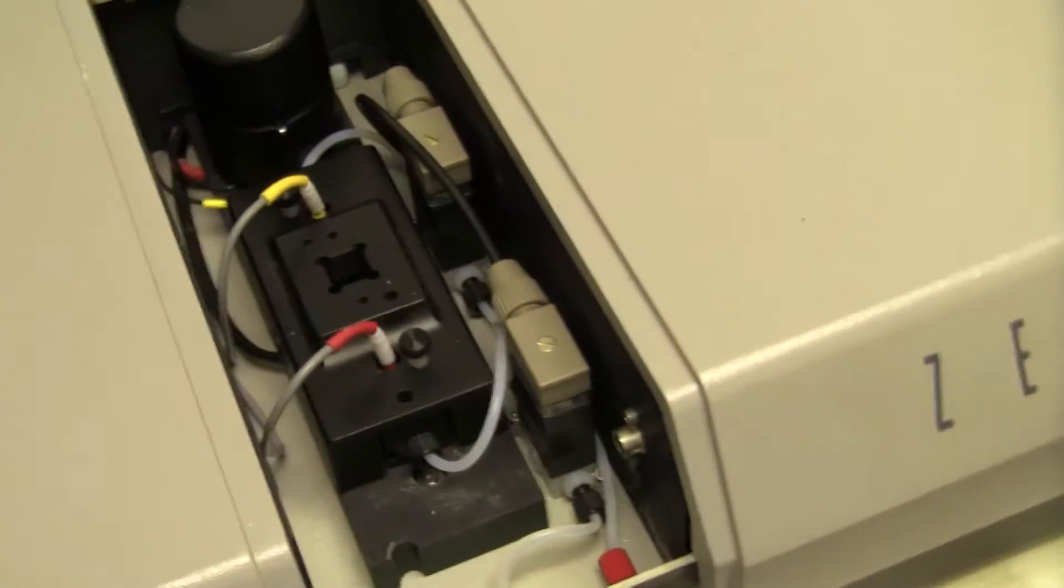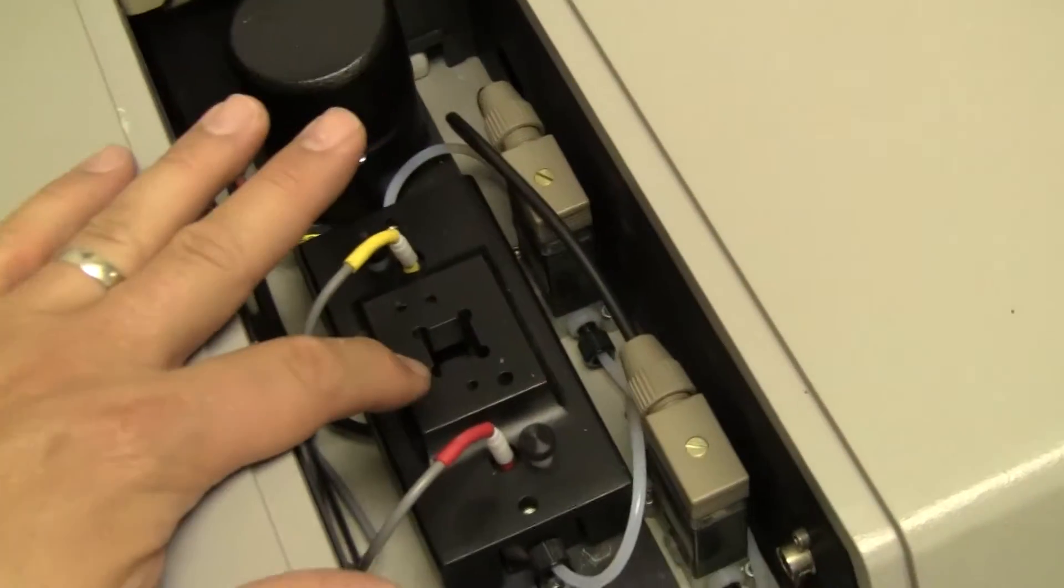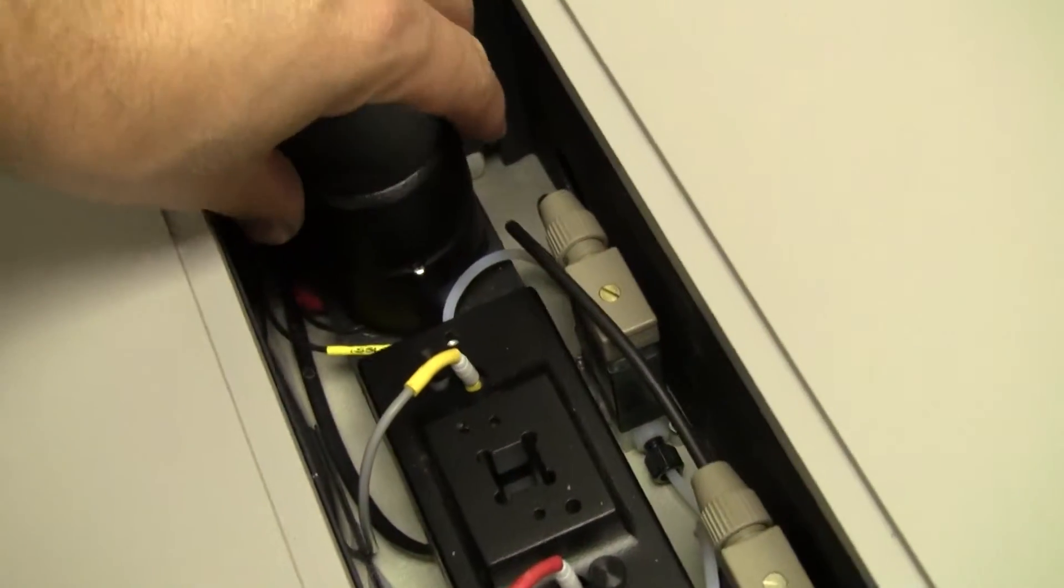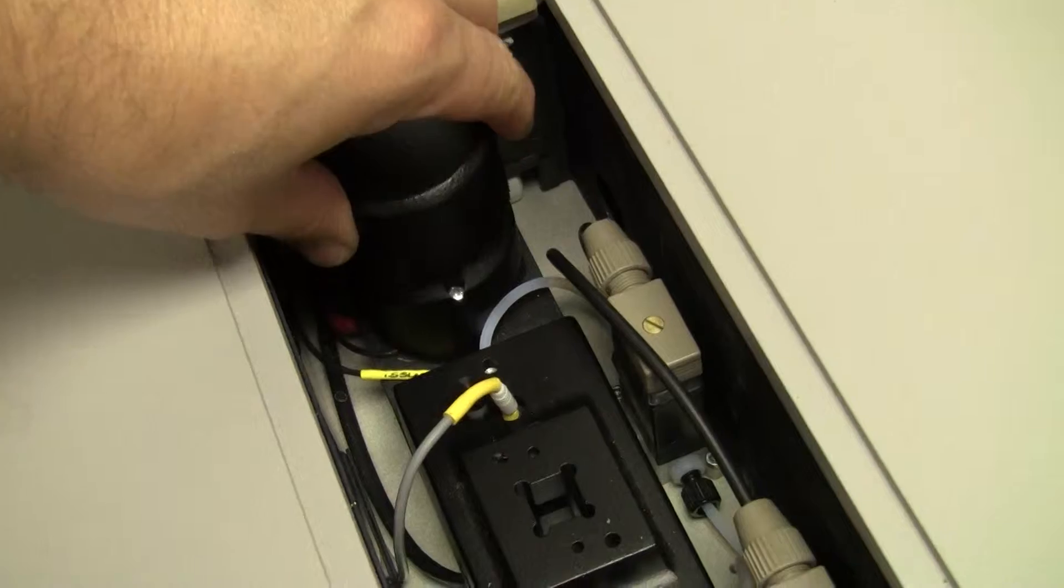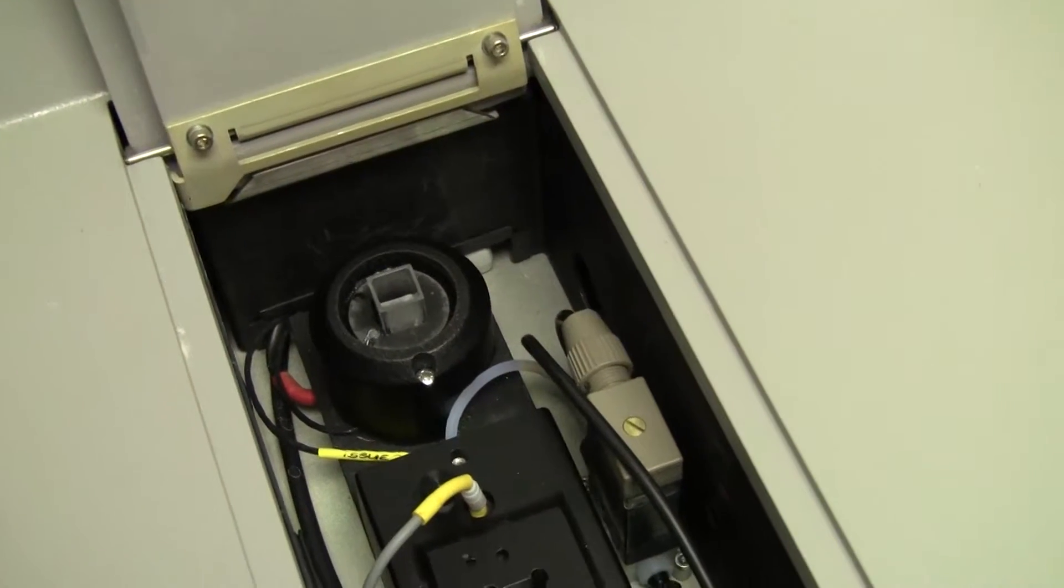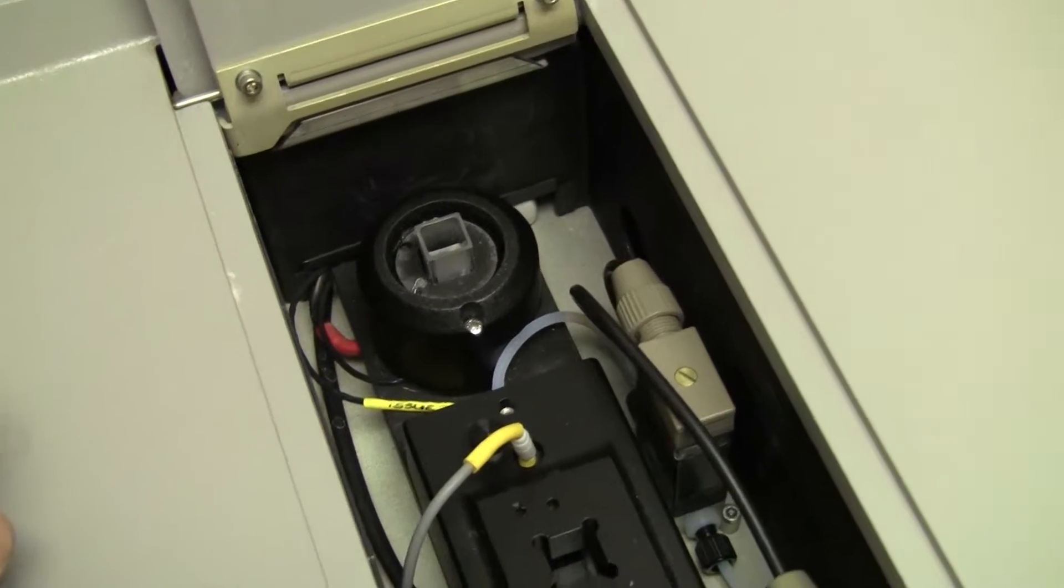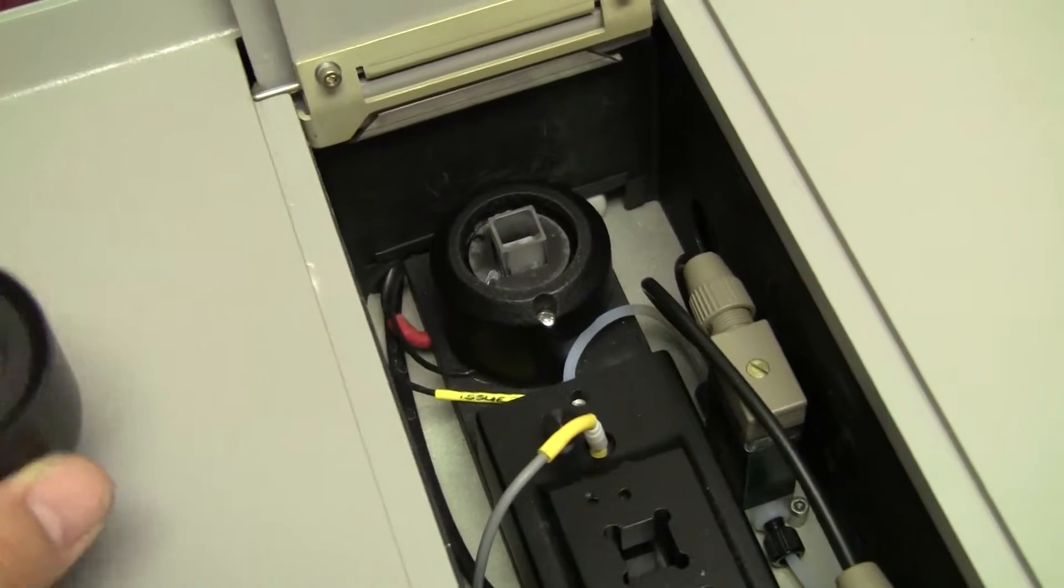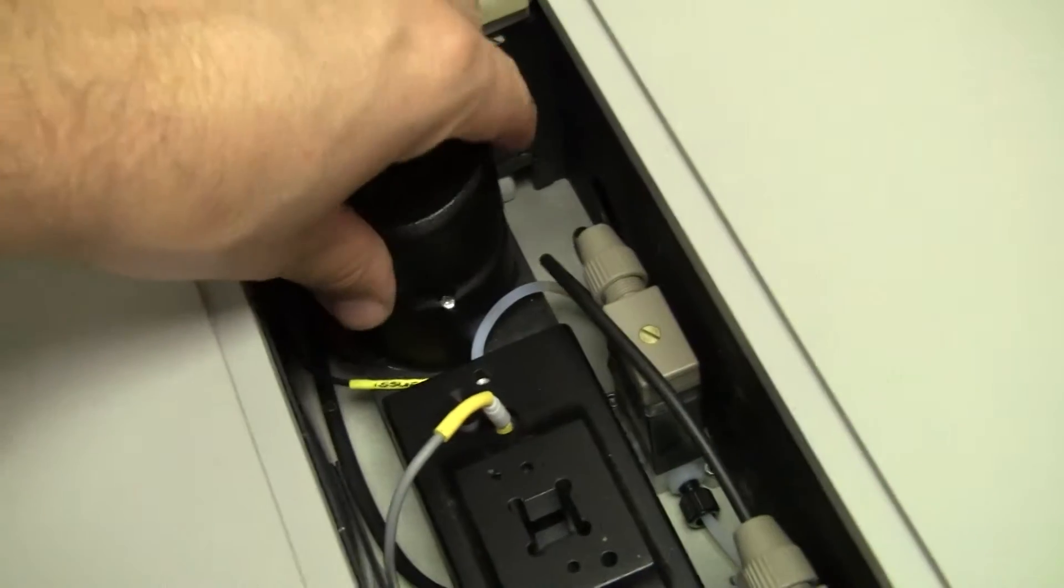There's actually two cells. There's one in here that you're squirting your sample into. That's for the Zeta, and that's for your regular particle size analysis for laser diffraction.